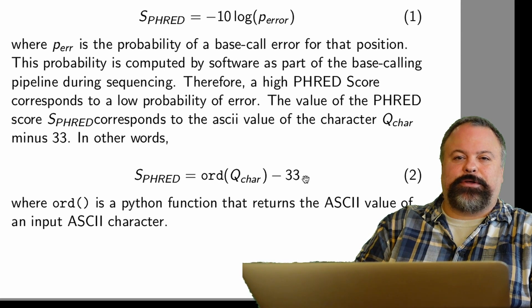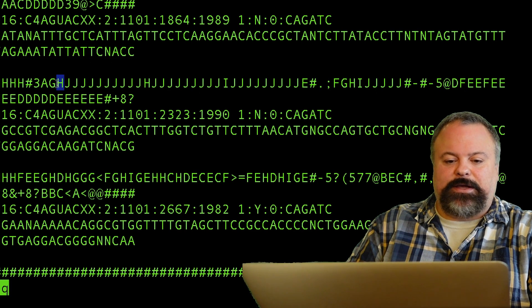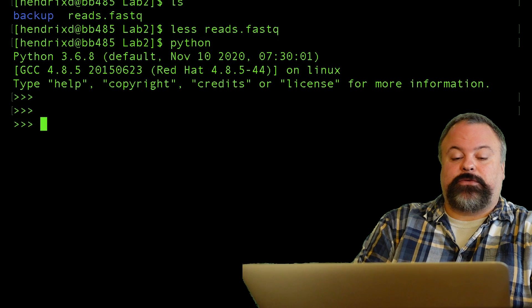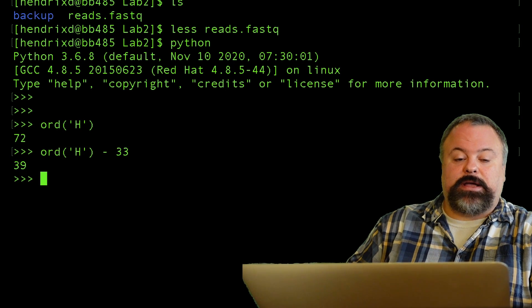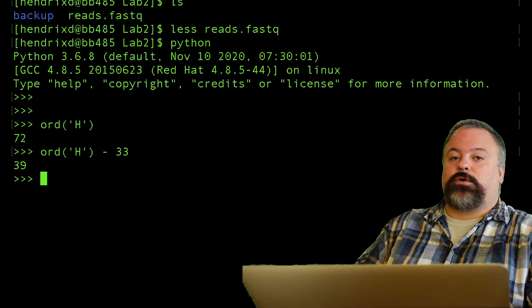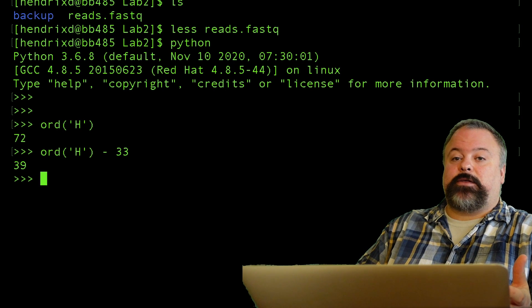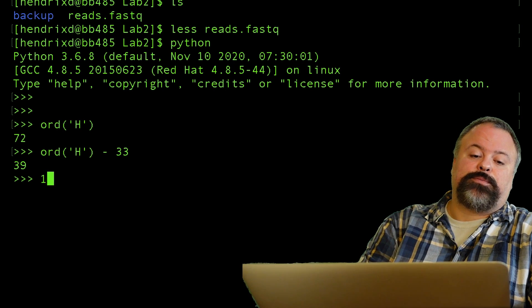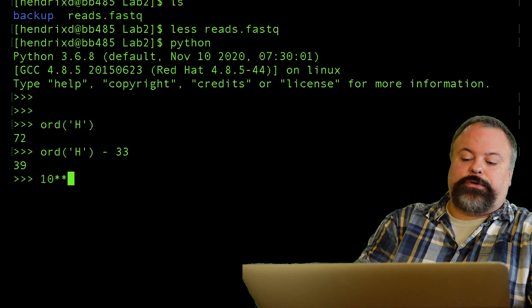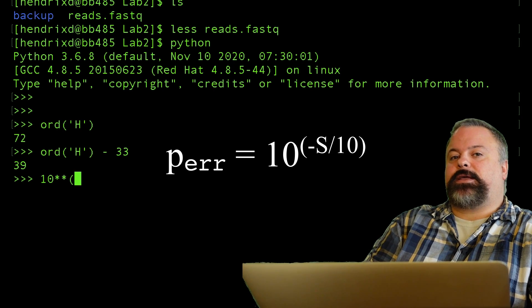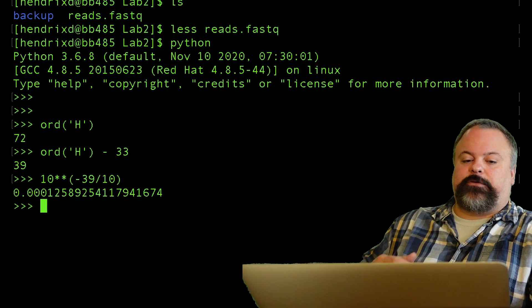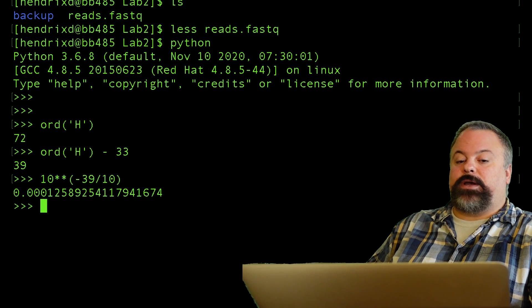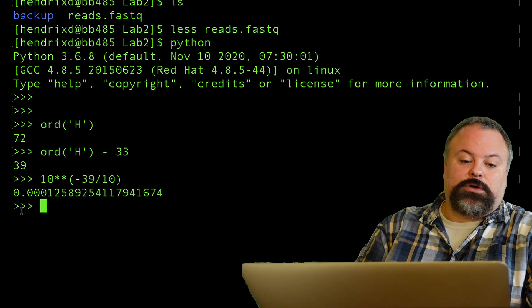Let's see how to do this with a particular file. If I take the character 'H' from the quality string and enter the Python terminal: I call ord('H') — in quotes because it's a character, not a variable — and subtract 33, giving me 39. So 'H' corresponds to a FRED score of 39. To find the corresponding probability, we invert the equation: 10 to the power of negative 39 divided by 10, which is 10 to the negative 3.9 — pretty close to 10 to the negative 4.